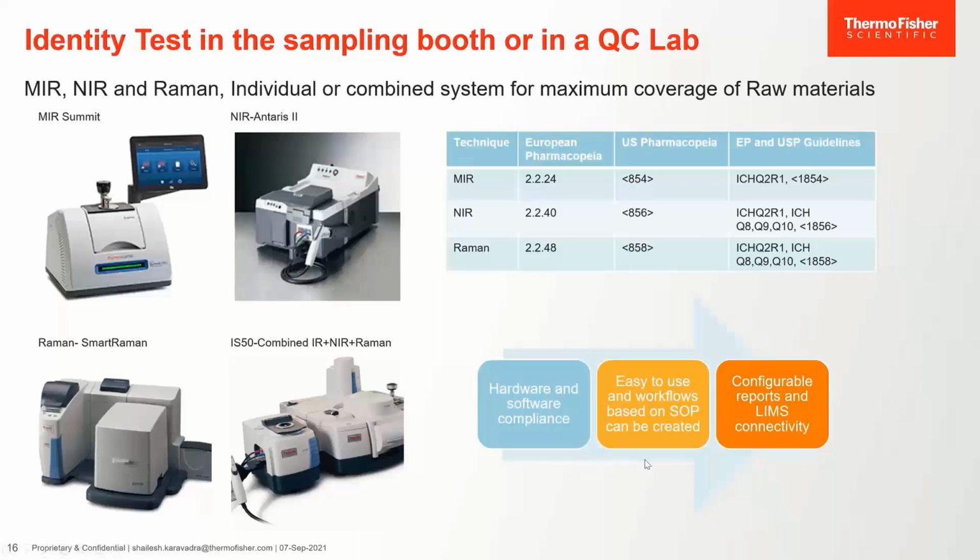And then, can it be really easy to use for operators who are not spectroscopy scientists? So it should be easy to use. It should have workflows based on SOPs that can be created with the software. And can you easily configure reports and reporting to external LIMS, for example? So these are the main criteria on which the selection is done, of course.